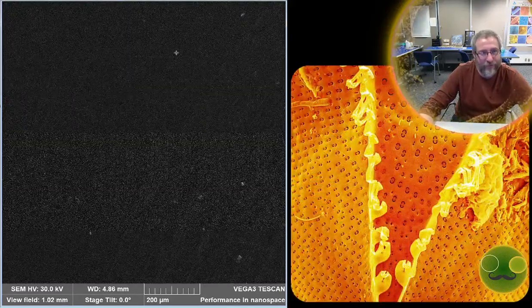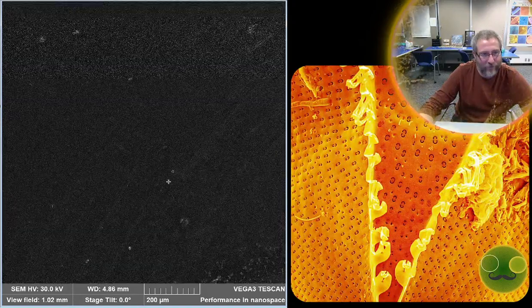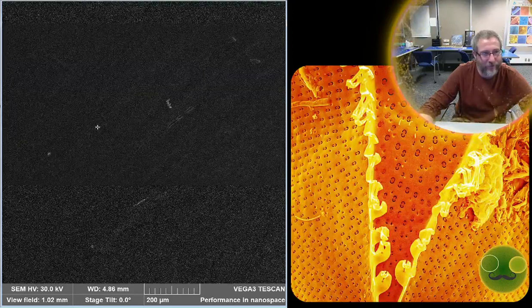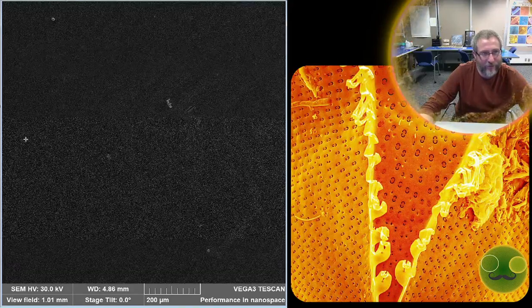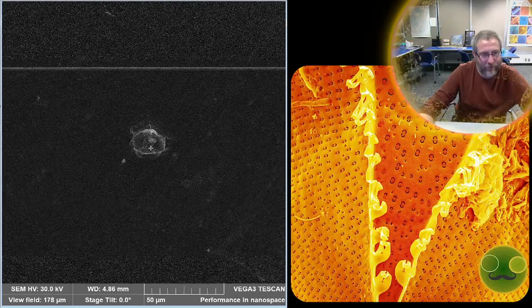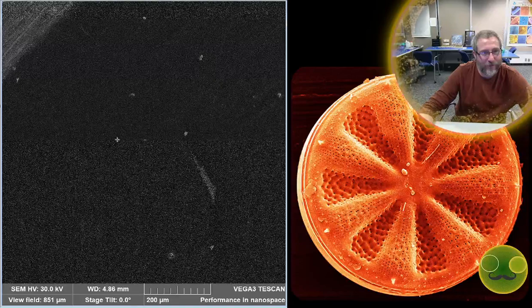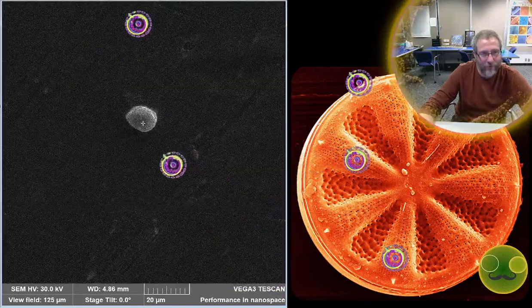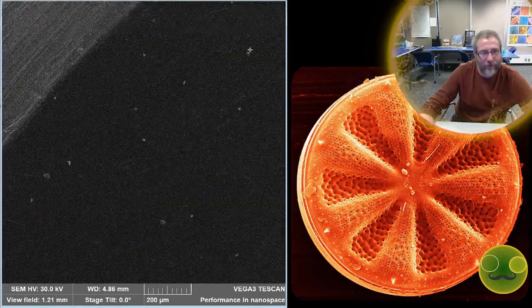I don't know that we'll find an internal view of this weird little cyclotella that's any better than the one that I already have. I just thought I'd come give it one little try and see how things went, and see if we could find anything, but mostly I'm finding junk. So I may make some more slides of these to scope out what's going on with that other sample. I may make some of these while I do that and see if I can get some higher concentrations.